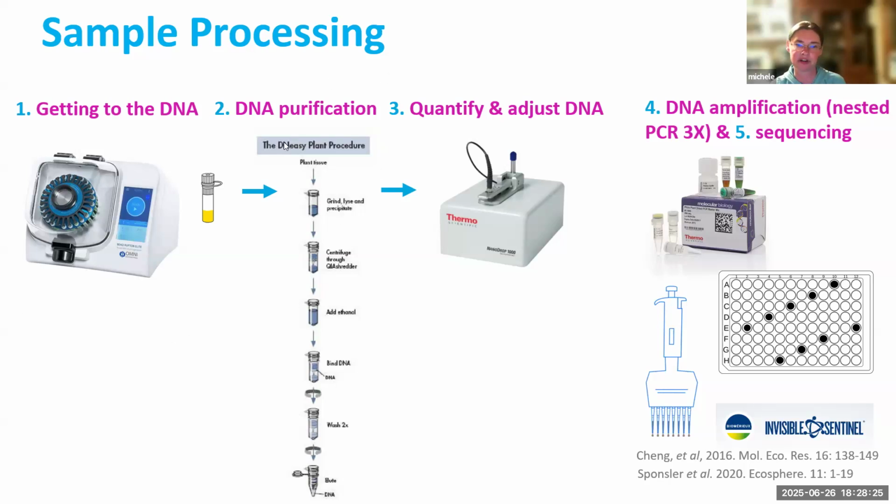We then use the commercial kits to purify that DNA away from the other cellular garbage that was in there that we don't need. It's just going to interfere. The DNA has to be quantified. So I need to know how much is in a sample.